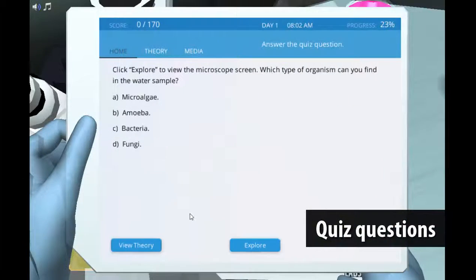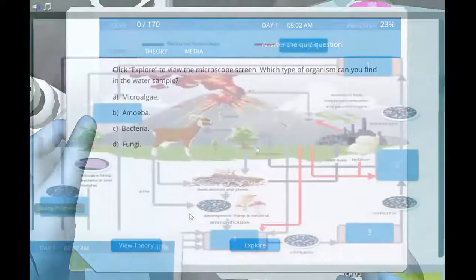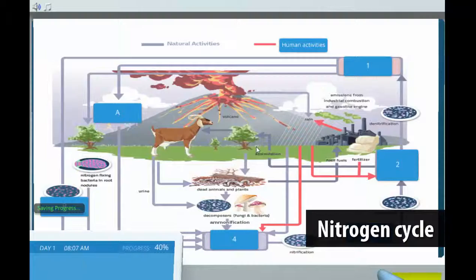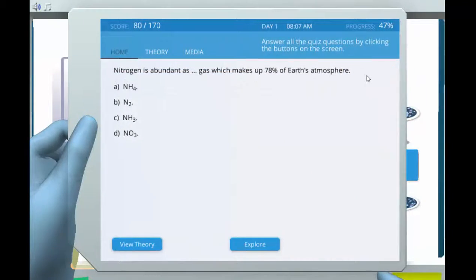Quiz questions throughout the lab check students' understanding. Students will also learn about the nitrogen cycle and how human activity can influence it.